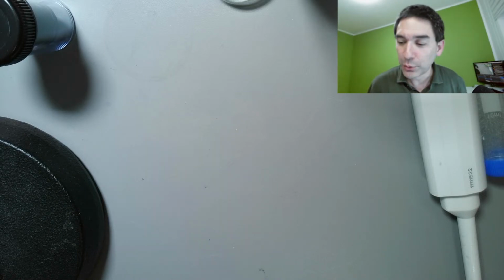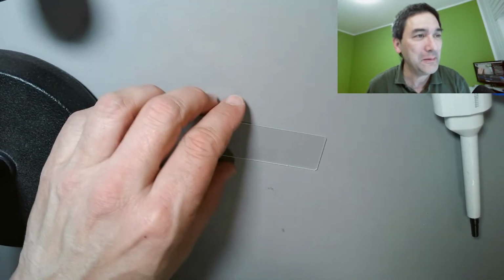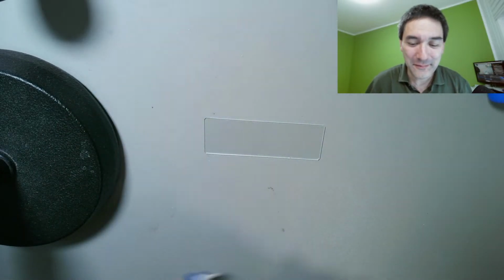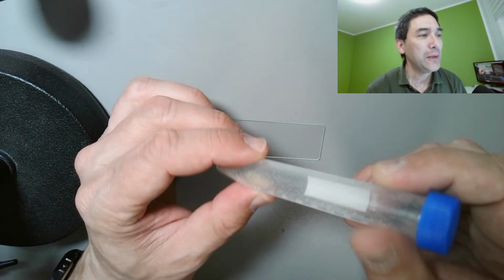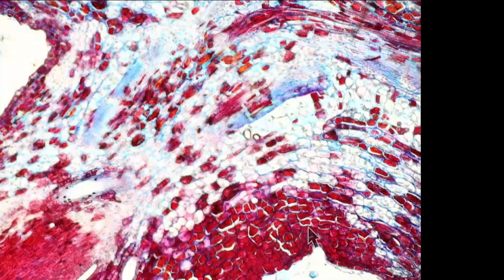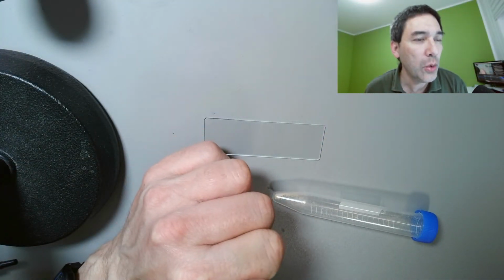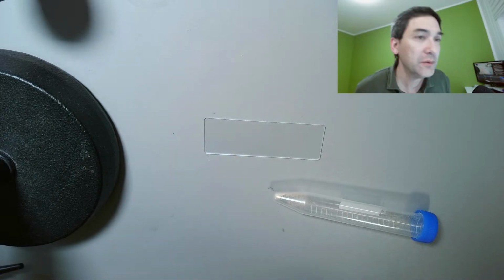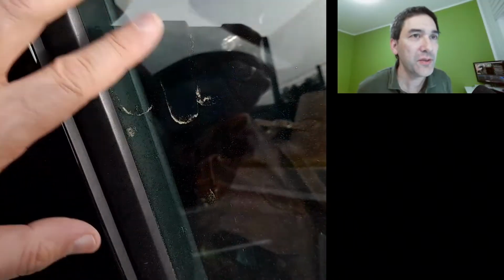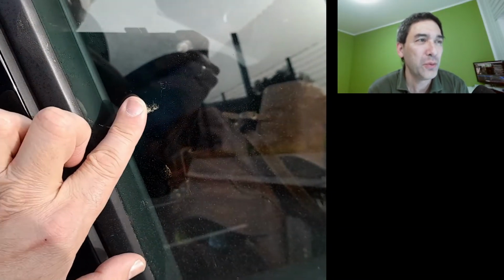Okay, as promised, today's live stream is, I would say, not chaotic, but at least has a variety of topics. And I would like to show you now a short video that I made. See, this is again something where you do not see me. So what I'm going to do again is copy myself over to the video so that you're also able to see me. Look, this is on my car window about 2 or 3 days ago.